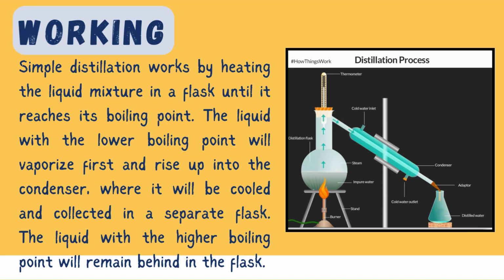Okay, now let us understand it with an example. Consider you have a mixture of water and ethanol and you need to separate the ethanol from the water. To do that, we add the mixture to the flask and start heating. On applying heat to the mixture, it will start to boil. And after a certain temperature, the ethanol will start to vaporize first, as it has a low boiling point of 78.37 degrees Celsius compared to water. The vaporized ethanol at 78.37 degrees Celsius is collected into the other vessel after condensing it with the help of a cold utility.